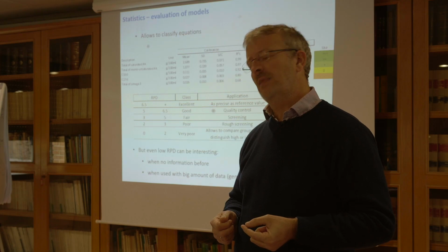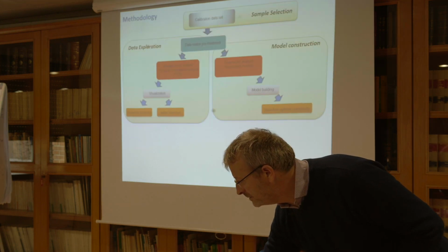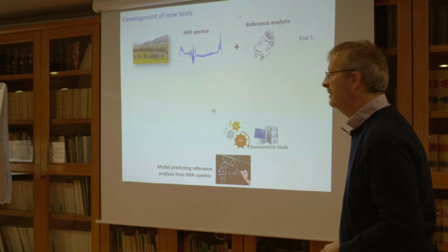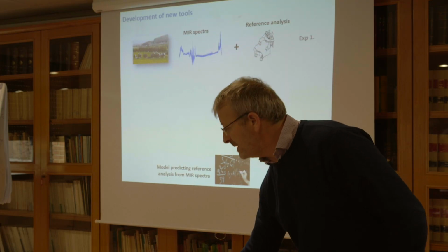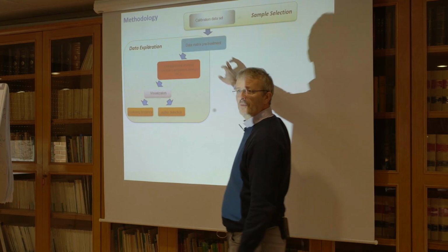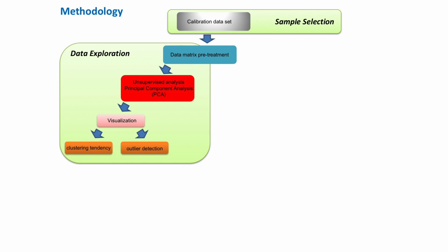But the second question was, just to show to you, here it's a spectra. And sometimes you say to me, oh, you have negative absorbance. Yes, that's true. That's why, in general, the first step that we make is a pre-treatment. We make a pre-treatment to change this negative information into positive information. So meaning that we do a kind of transformation? Yes, we make a simple transformation.